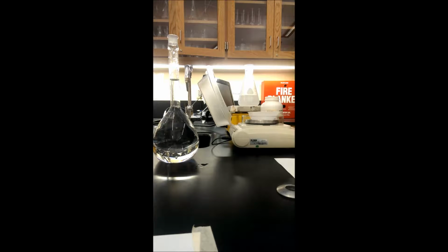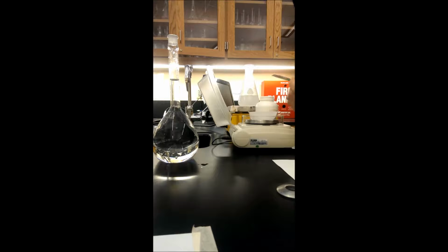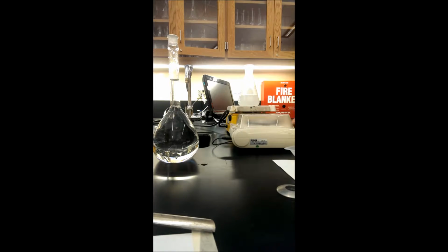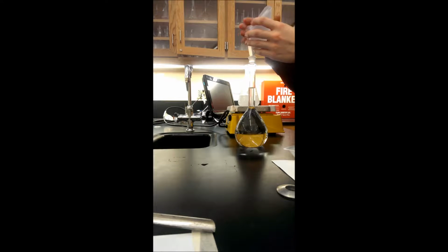So my experiment was determining the amount of vitamin C in different fruit juices. I'll talk about which fruit juices I chose later on. And so right now I'm measuring out potassium iodide to make an iodide solution with distilled water. I have 500 milliliters of distilled water in the flask there, and I'm just adding in the potassium iodide.